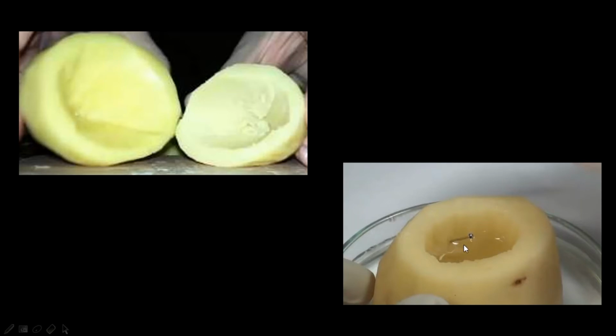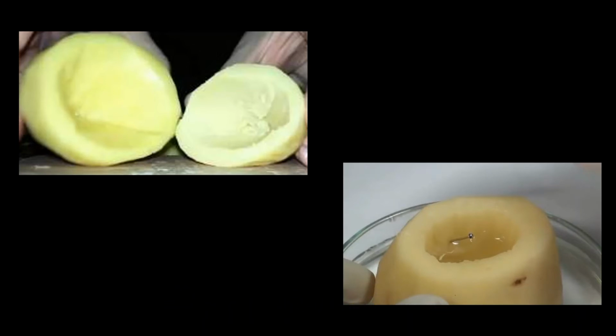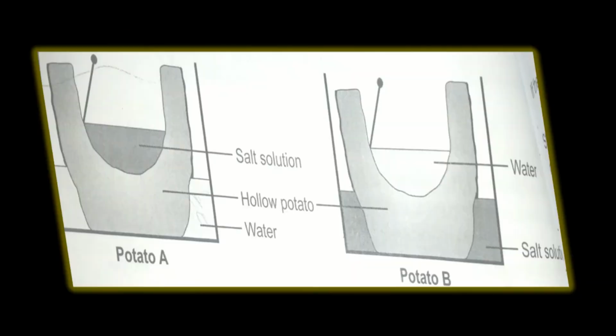The function of the pin is that we want to put the pin in our hole where our water level is ending, to show the starting level of water. We want to see, will the water actually increase in our potato, or will it decrease? You will understand this when we move on to the next slide.